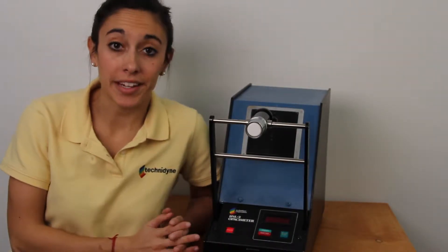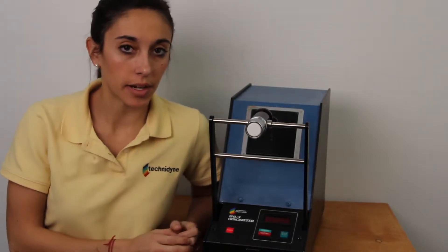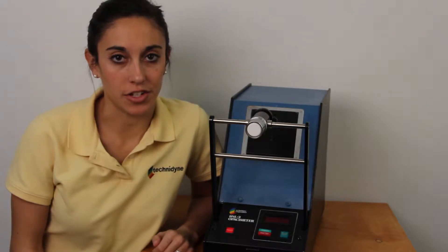Today we're going to talk about Titanidon's BNL3 Opacimeter. Now before we can actually use the instrument, it needs to be running for about 15 minutes. So while ours warms up, I'm going to show you everything that you'll need to do your calibration.